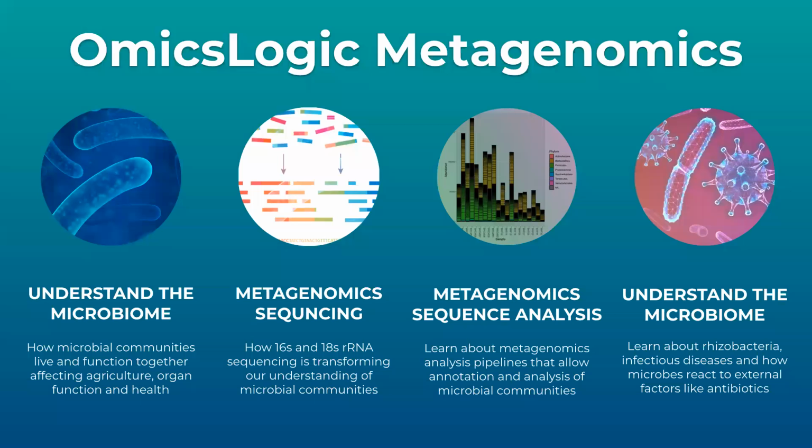And we'll look at it from several standpoints. We'll look at it from the standpoint of microbial drug resistance. We'll look at it from the standpoint of viral evolution, and how viruses evolve to overcome a series of challenges that they encounter due to the immune response. And we will also take a look at other types of projects like the rhizobacteria in soil to really see the diverse application of metagenomics that are applicable to this type of analysis.